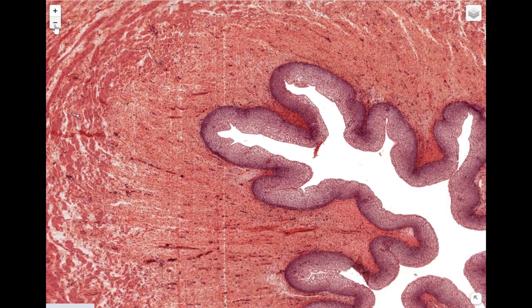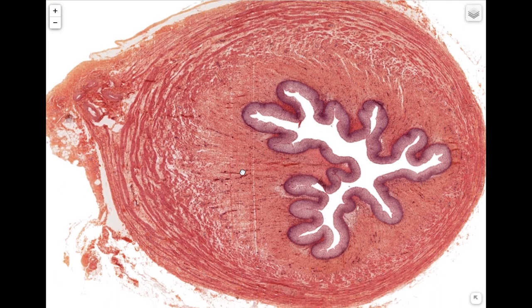In reality, this is the ureter — a cylindrical organ that carries urine from the kidneys down to the urinary bladder. It makes sense that its lining epithelium is transitional epithelium. At present the lumen is collapsed, but it has the ability to open up, with the lining epithelium flattening out, reducing the number of cell layers, and the apicalmost cells changing shape from cuboidal to more squamous in morphology.